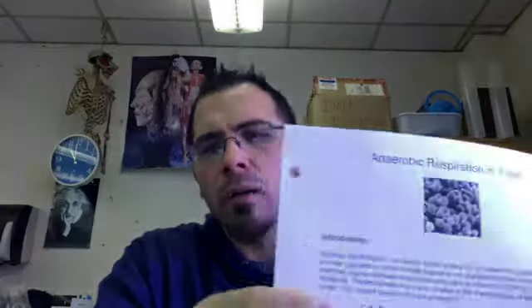All right, AP Bio, since I'm not going to be there on Thursday, I'm going to go over the lab or activity I want you to do in class. It's called anaerobic respiration yeast. You can read the introduction on your own. There's the objective. You're going to investigate the process of fermentation. You're going to analyze some data.